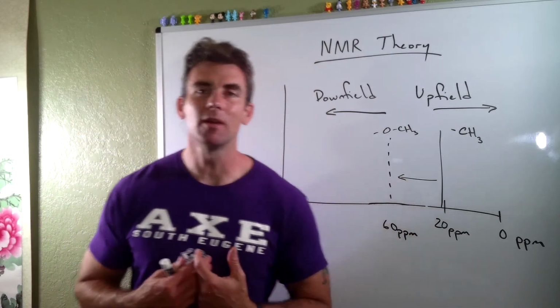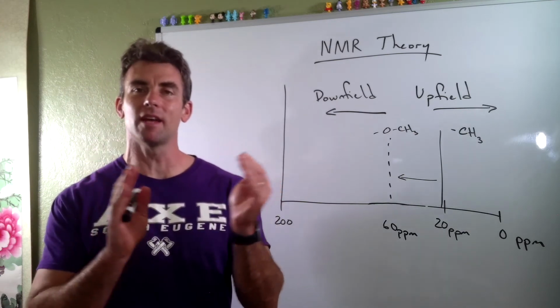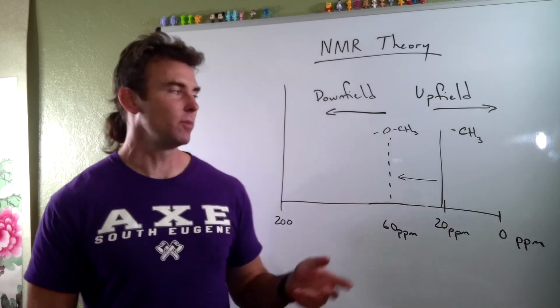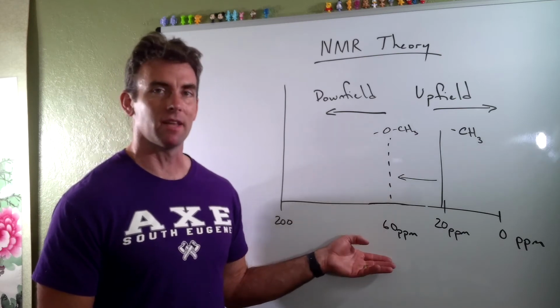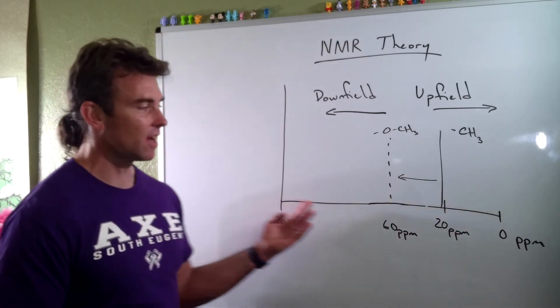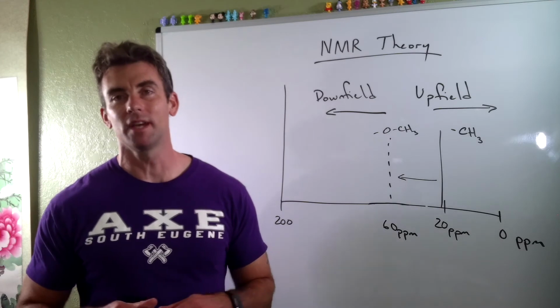That's something that we're going to learn to recognize. We're going to be able to look at a spectrum and, based on the position of peaks, give an educated guess about the molecular structure. That's probably where the oxygen is bound. That's the carbon that corresponds to that particular oxygen. And so as we look at this parts per million scale, there's a couple of areas that are going to become pretty important to us.